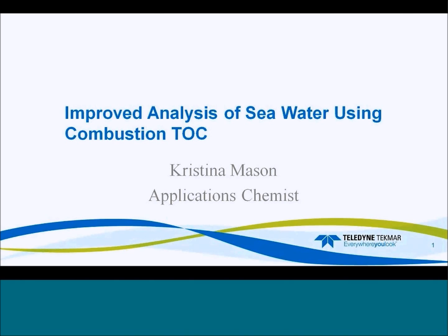Good morning, everybody, and thank you for joining me. Today we're going to talk about analyzing seawater and saltwater using Combustion TOC. The presentation is called Improved Analysis of Seawater Using Combustion TOC. If you have any questions along the way, please type them in and I'll get to them at the end of the presentation.